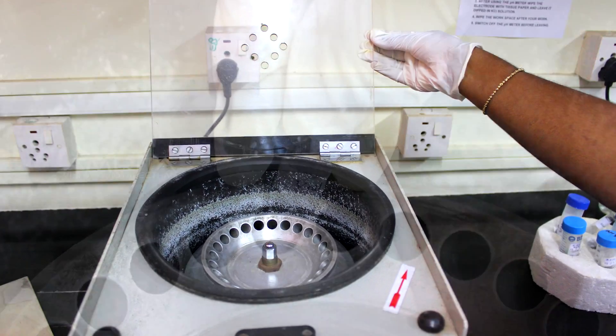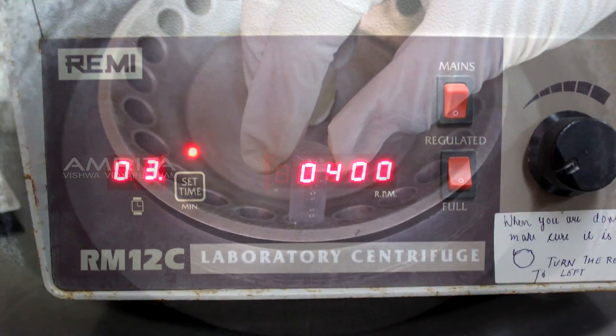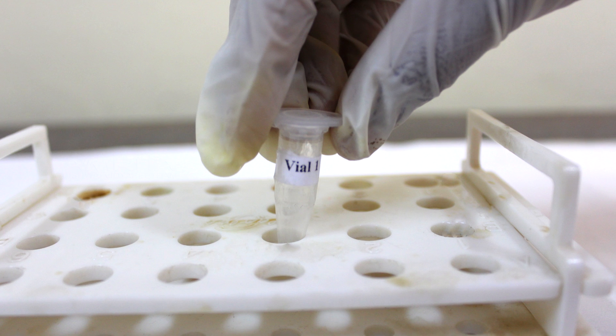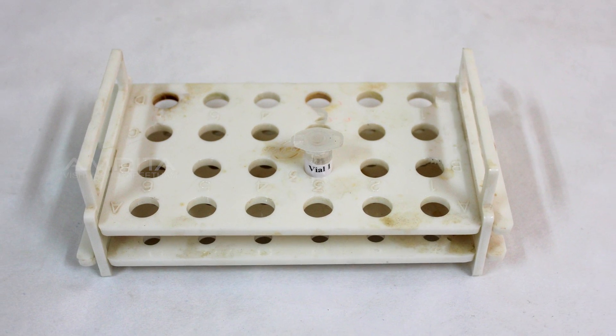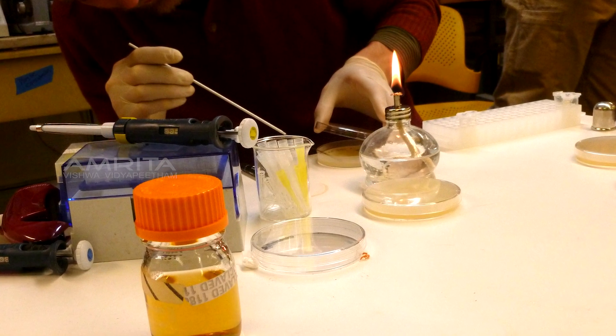Now keep this vial in the microcentrifuge and spin it for a few seconds along with the balancing tube. Then remove the vial from the microcentrifuge and place it in a vial rack and incubate the vial for 2 hours at room temperature. After 2 hours, the ligated mixture can be used for transformation.